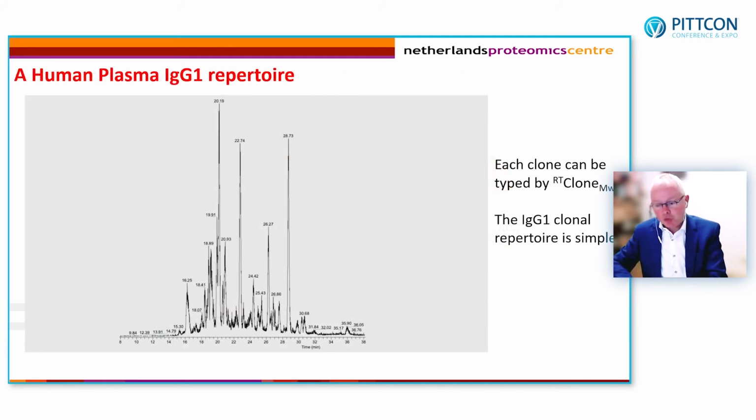So then we collect all these IgGs from serum, we produce all these Fab molecules, and these Fab molecules have a mass of about 45 kilodalton. We cleaved off a major part of the rest of the molecule. We bring all these molecules to the mass spectrometer and we just subject them to LCMS. And that's what you see over here. This is the LCMS trace that we get.